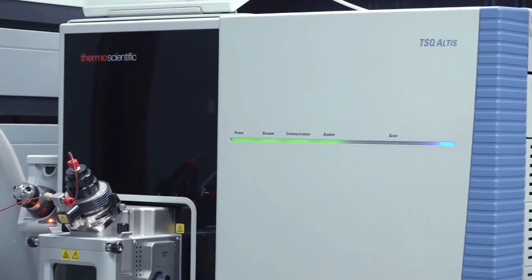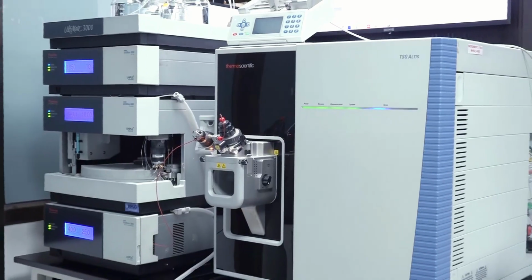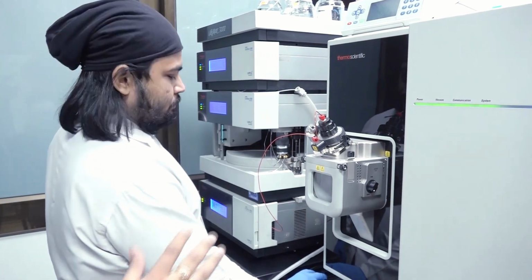Here we make sure that the entire assay becomes more quantitative. Therefore, we first start with identification of a set of peptides to develop their transitions and run in the Skyline based analysis. After the preliminary analysis, we shortlist the peptides of interest and then we try to develop the heavy labeled synthetic peptides which can be utilized for the more quantitative analysis.